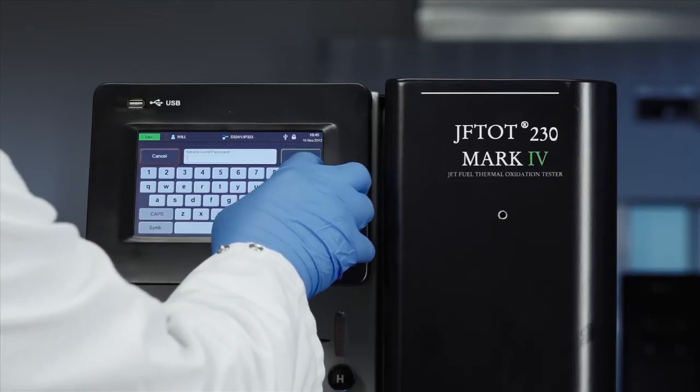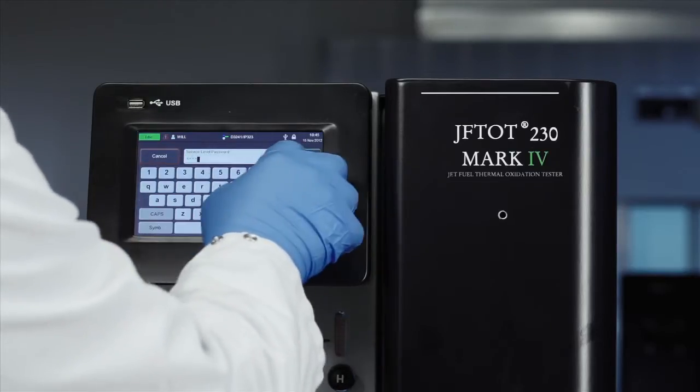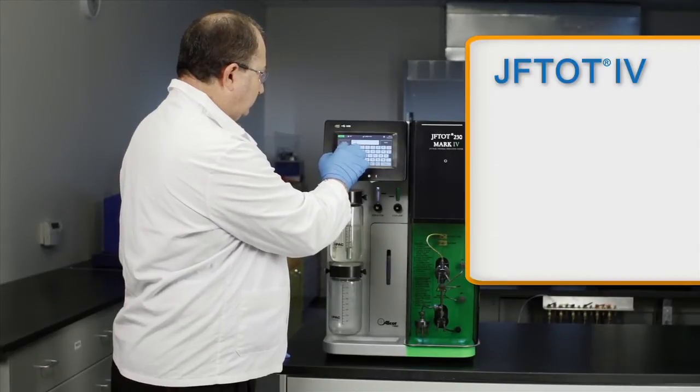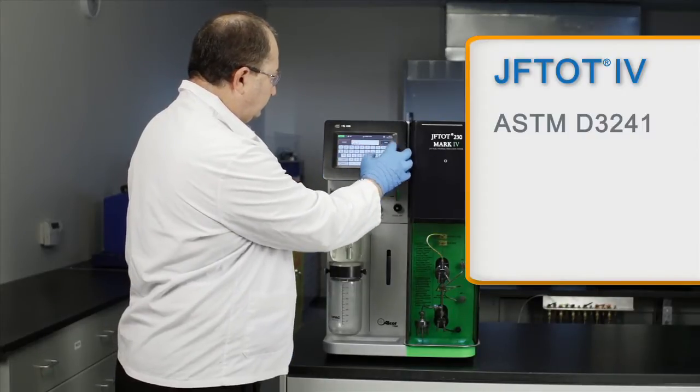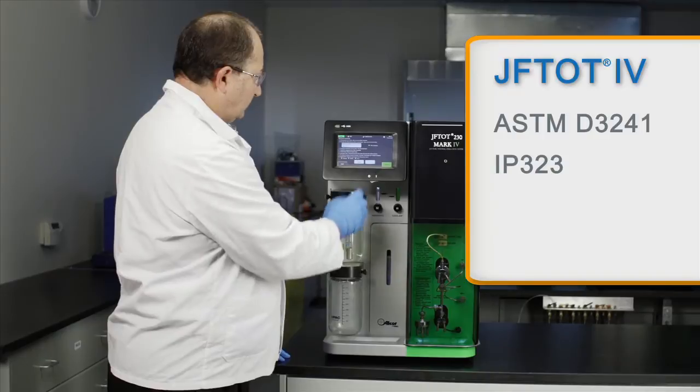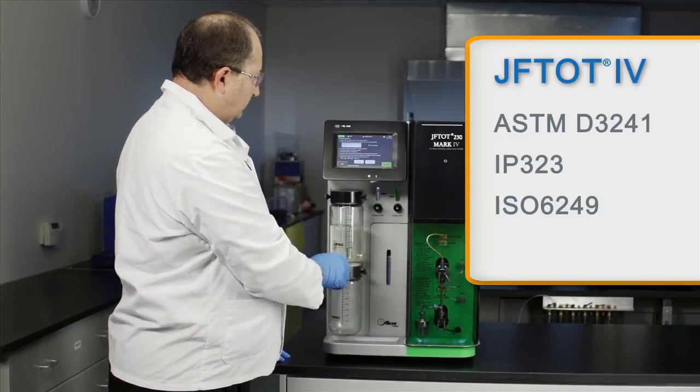On top of enhanced safety, simplified operation, and ease of use, the Jephtot 4 strictly follows ASTM D3241, IP323, and ISO 6249.